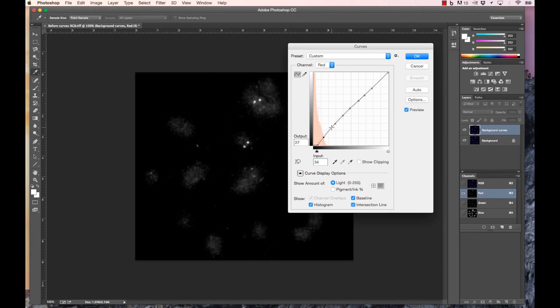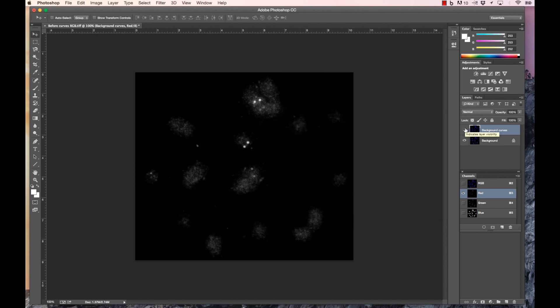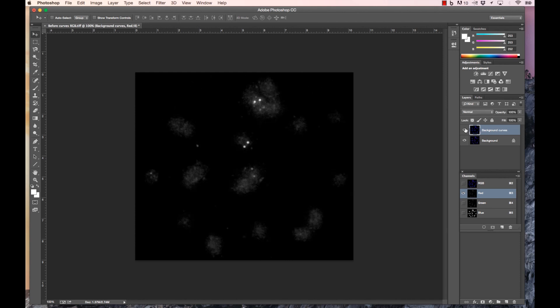Background is then reduced to the lowest level possible without diminishing the faintest signal. The strength of the small target hybridization signal is increased slightly and the background readjusted. Trial and error is required. Deselection of the visibility icon allows comparison between the curves processed image and the original.